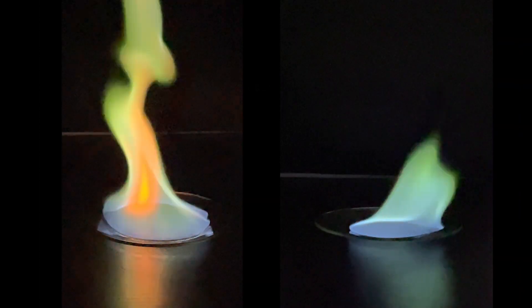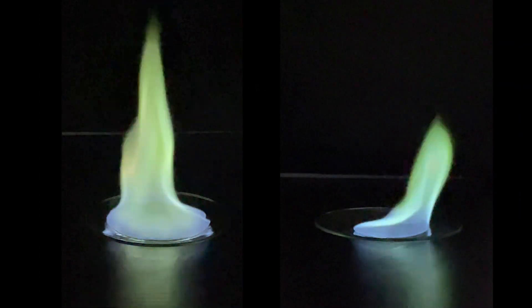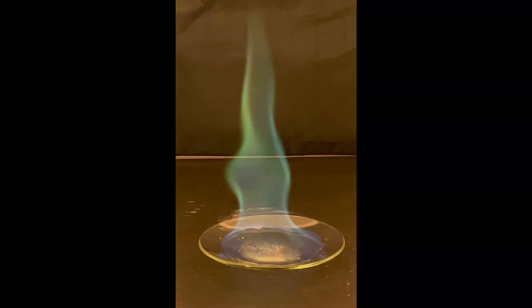Overall, I consider this a complete success. Nothing blew up, and the flame was beautiful.